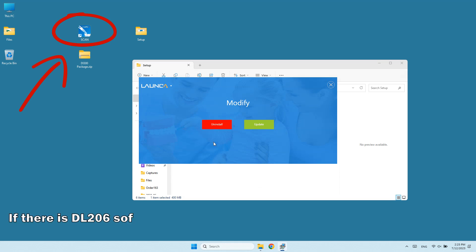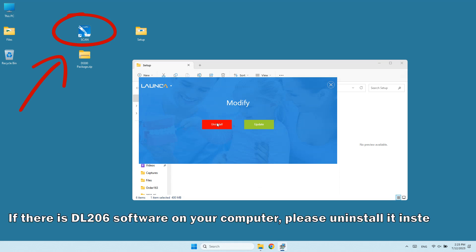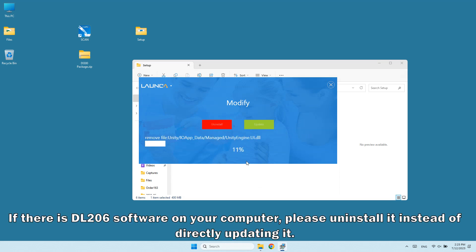If there is DL206 software on your computer, please uninstall it instead of directly updating it.